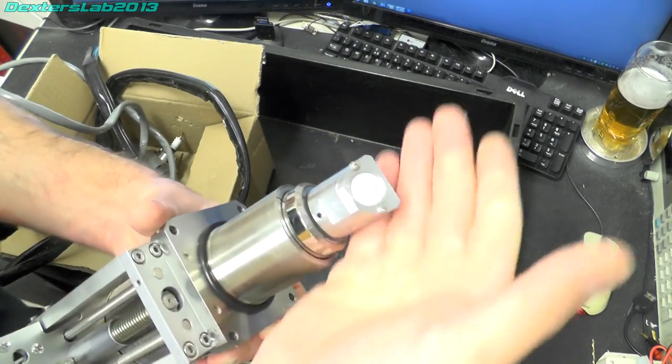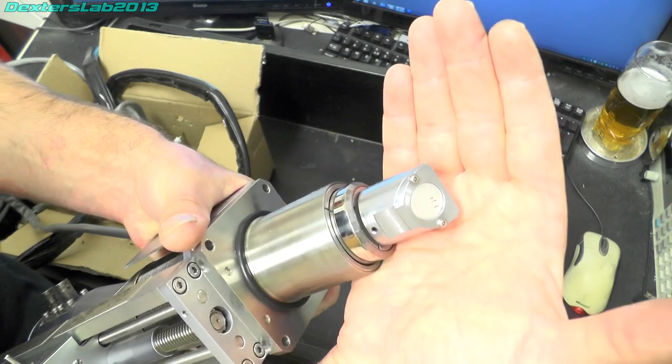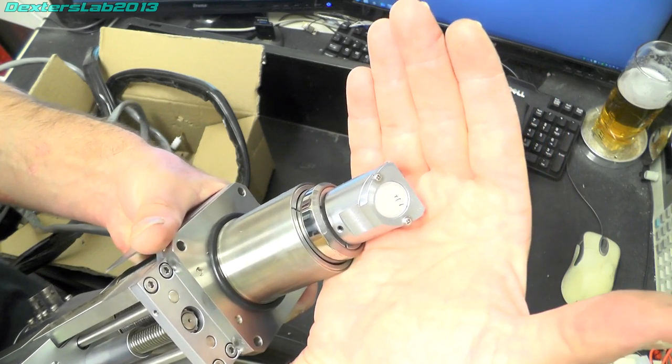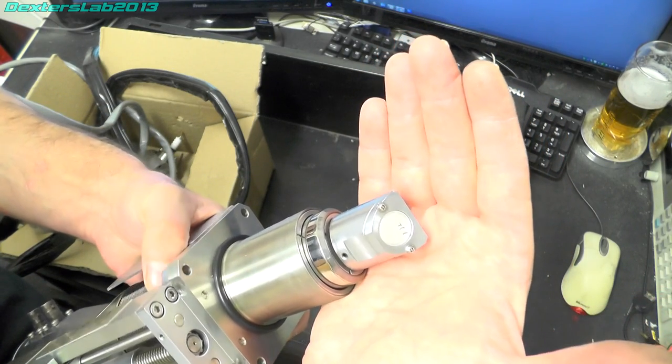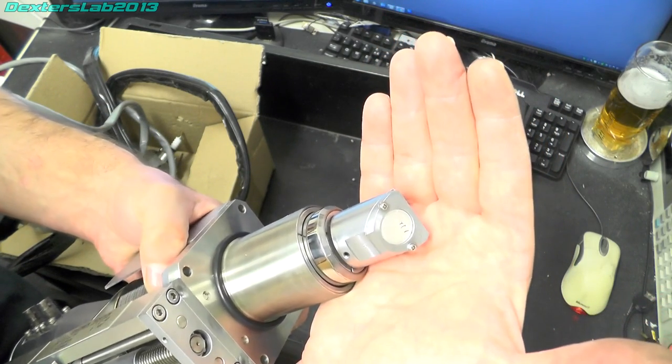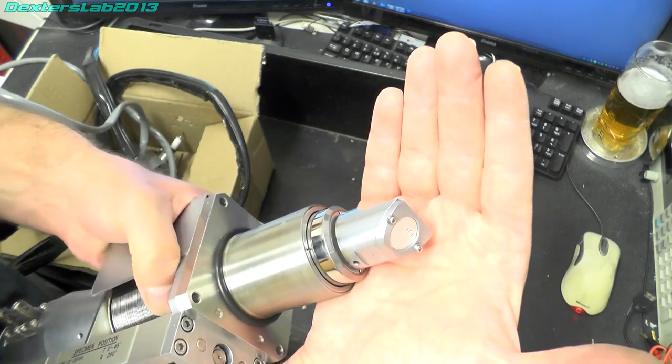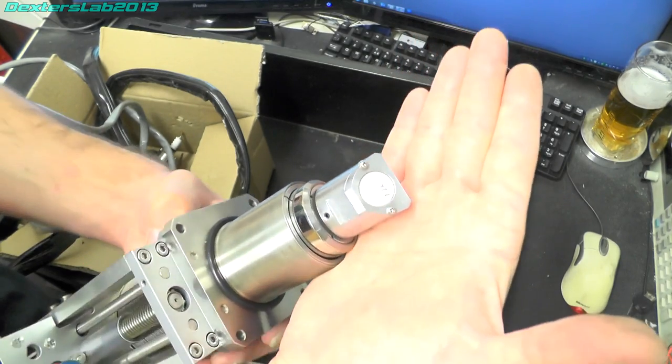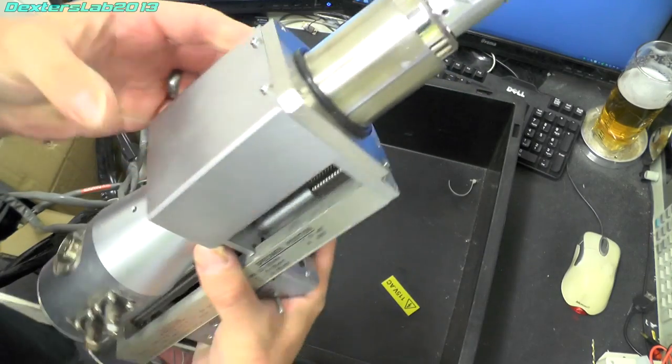And that was actually there as it arrived to us so that had obviously been damaged before we got hold of it unfortunately. There we go.